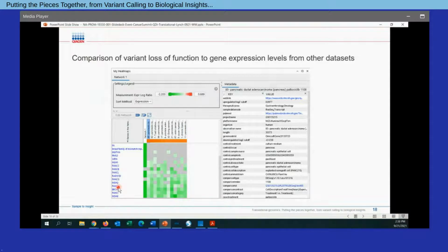And then in addition to this first column, we see a number of additional columns. And what these additional columns represent are actually gene expression studies from over 90,000 public studies that we have curated and pre-analyzed in IPA.